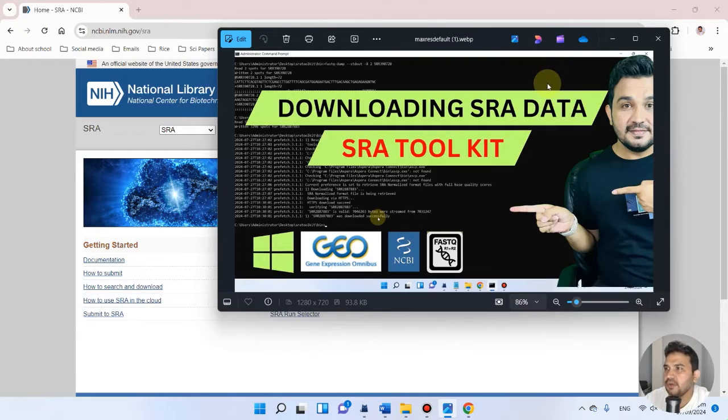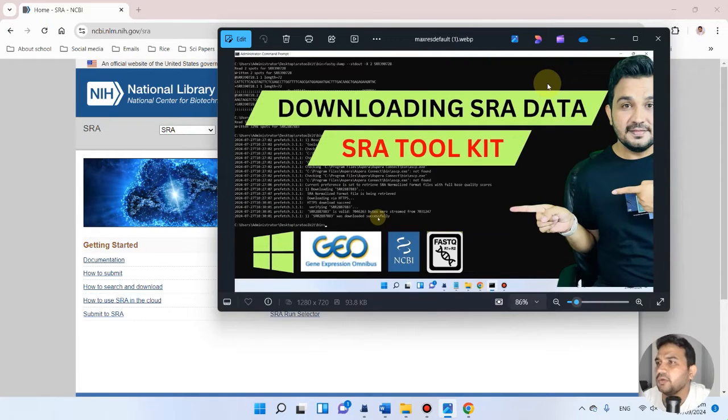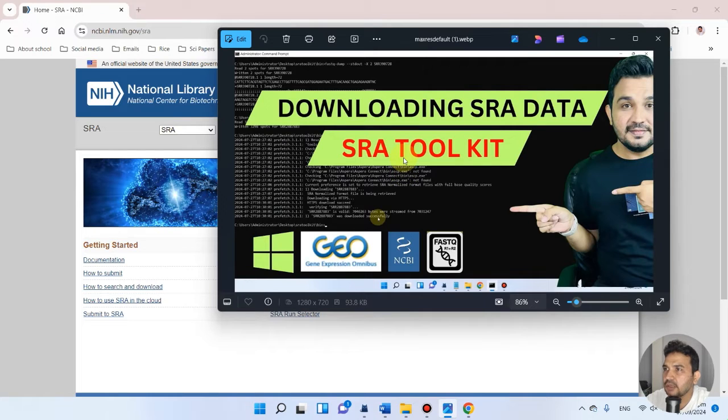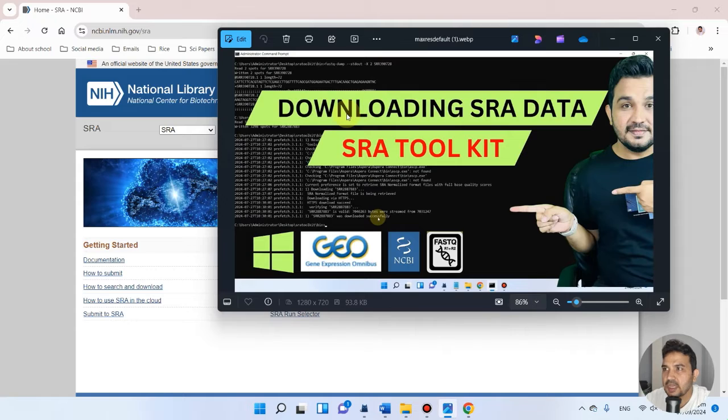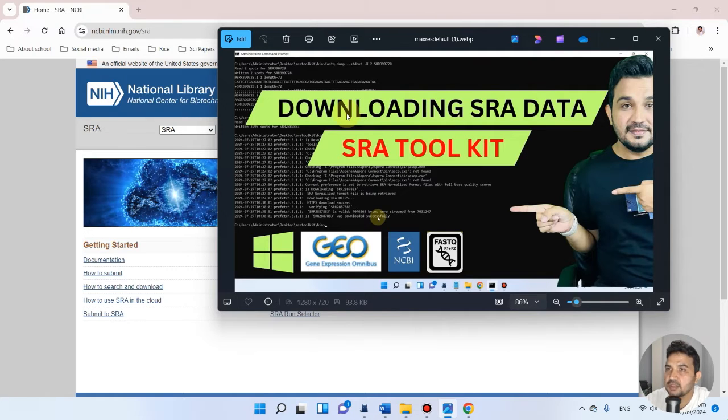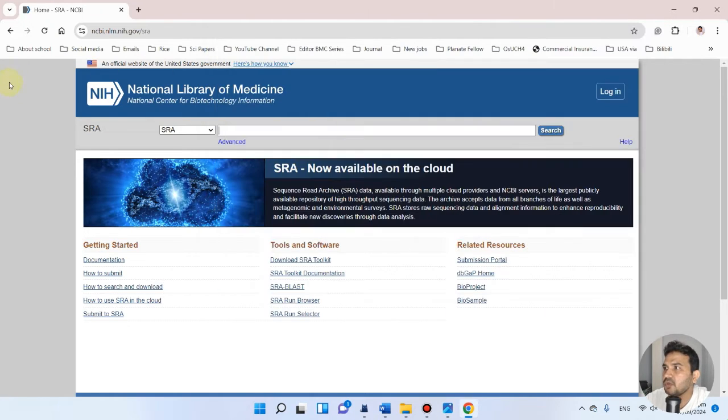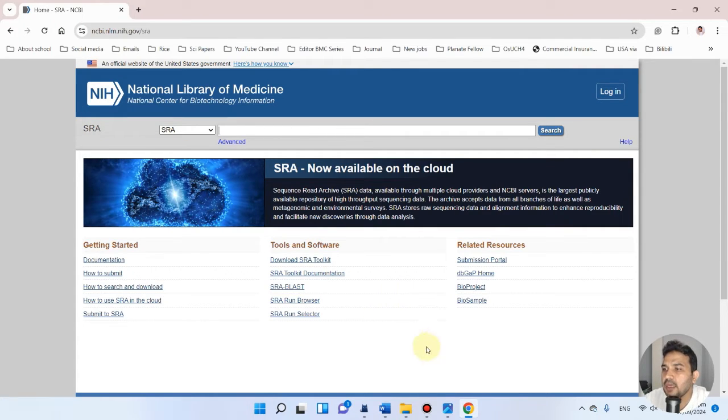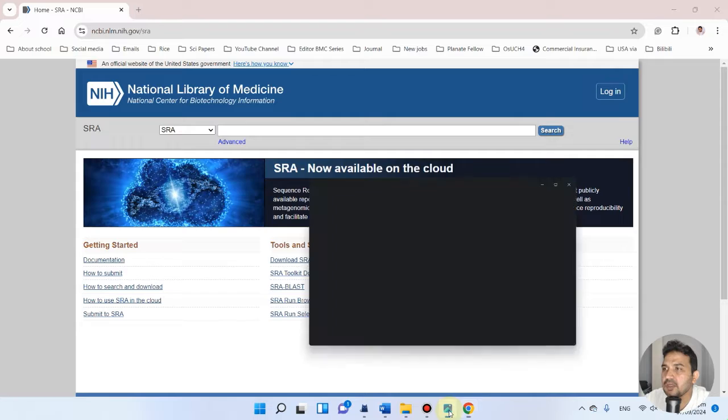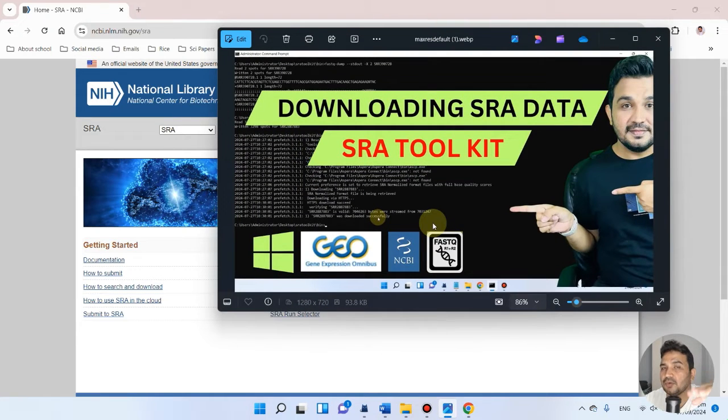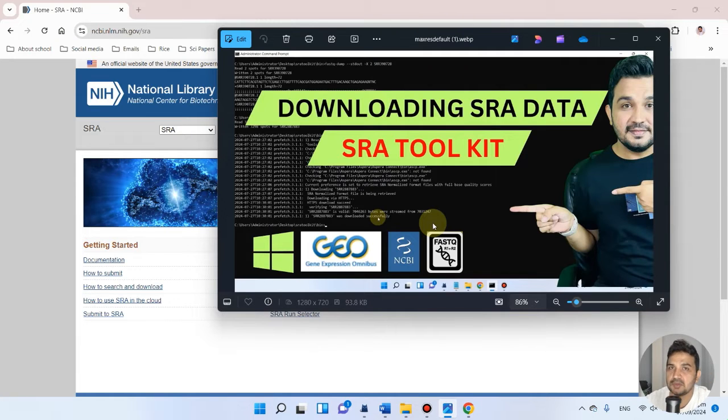Welcome to another video tutorial. In the previous video, I showed how we can use the SRA Toolkit to download SRA data. This toolkit is especially useful when you have many SRA accessions to download, because downloading from NCBI SRA one by one takes too long. In the previous videos I showed how to download one SRA accession, and in this video I will show you how to write code in command prompt for multiple FASTQ files of many SRA accessions.